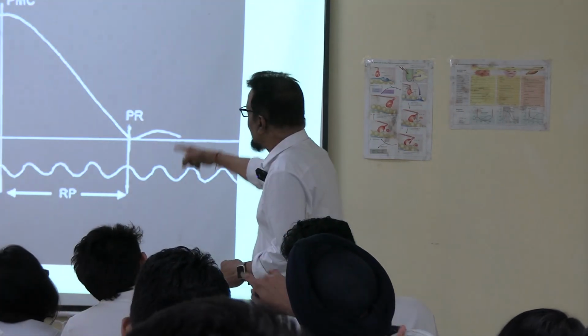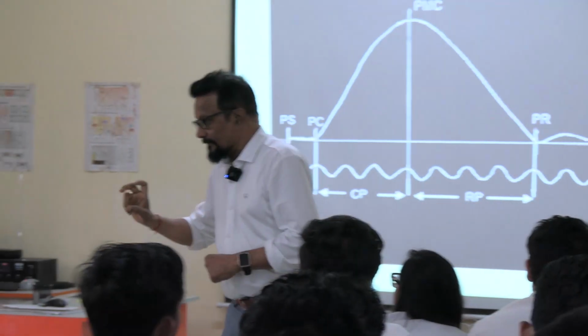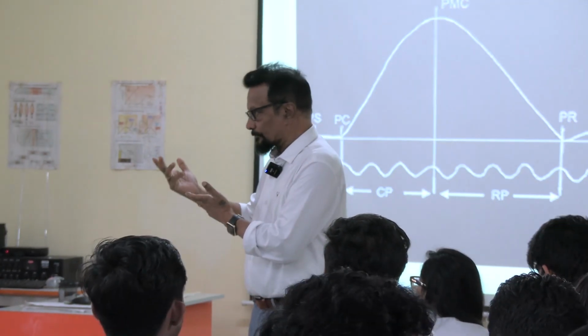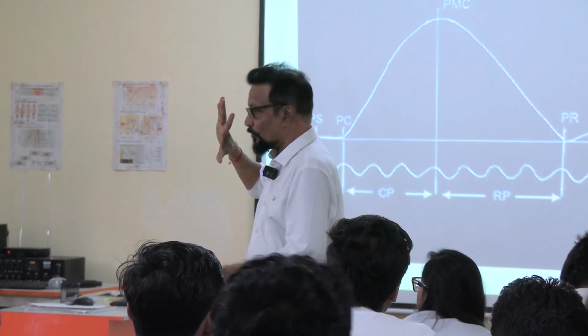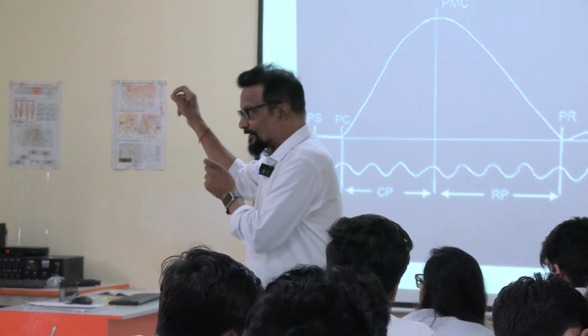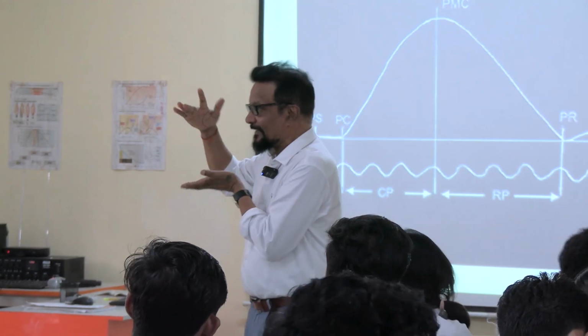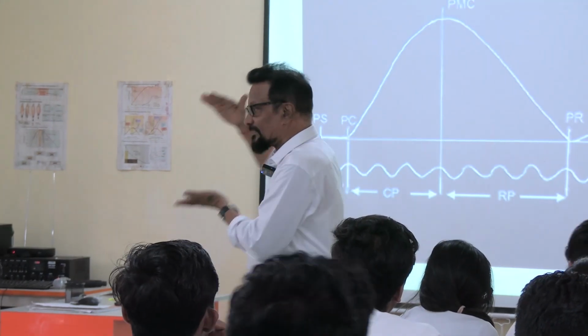And by a scale, you can measure the height also. Force, in terms of force I cannot measure, so the only thing I can measure is the height. If more force is generated, more height will be there. So force here will be represented by height in centimeters or millimeters. So you can measure it using a scale.